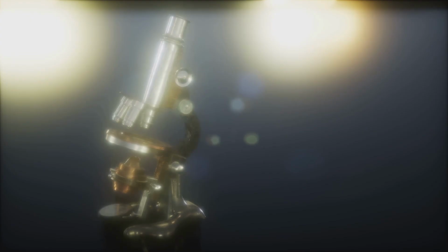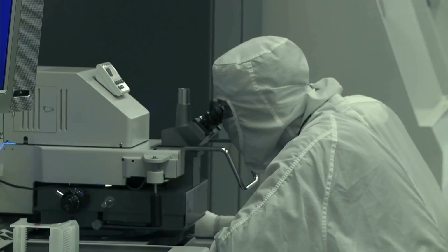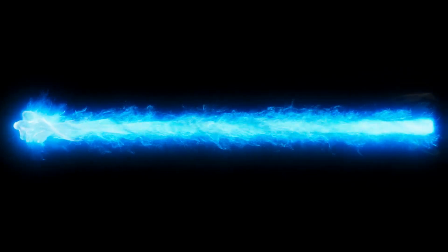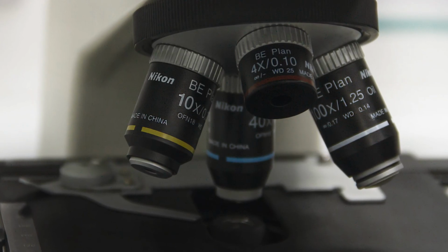Microscopy is vast, but it boils down to two main types. First, the light microscope, the one you saw in a science classroom. It uses visible light to magnify. Second, the electron microscope, a much more powerful, complex machine. It uses a beam of tiny particles, electrons. They work very differently, so they show different things and serve different jobs.